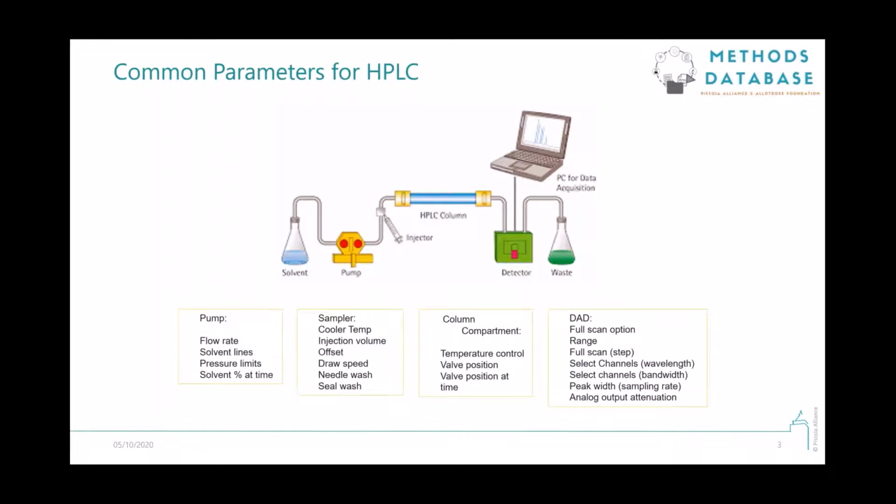So the reproducibility of the method based on this paper-based description is always a challenge. As part of that work, we have identified some parameters that are common across HPLC instruments and software systems from various vendors. And we have worked with Allotrope to define an ontology and data model to represent these parameters. And this data model has recently been released by Allotrope and has reached recommendation status.